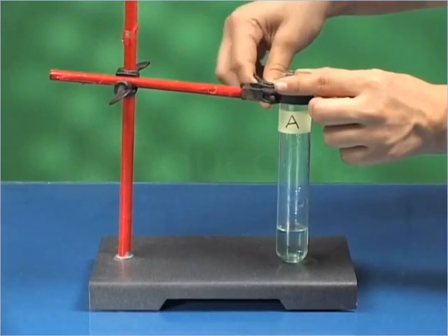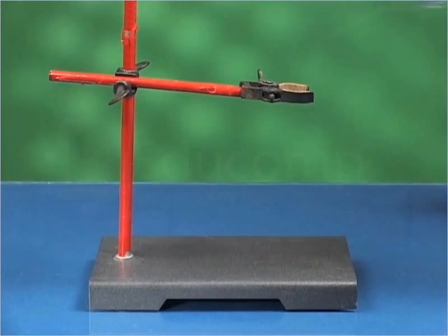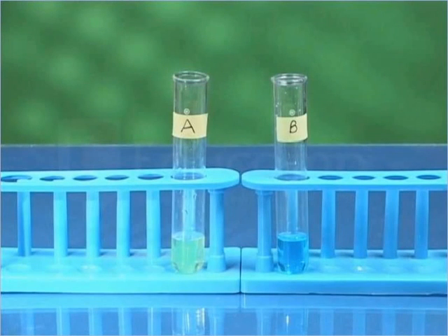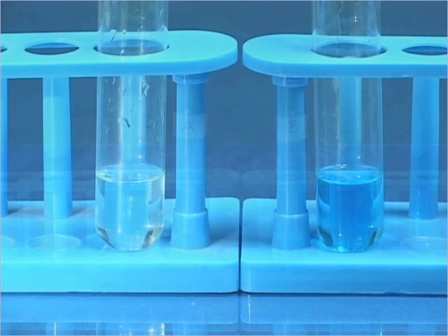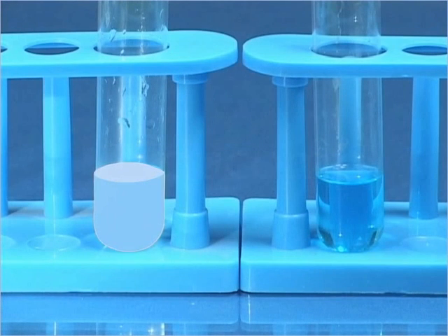Take out test tube A from the clamp stand and keep it beside test tube B for comparison. On comparing both solutions, you will find that the original deep blue color of the copper sulfate solution has faded away.